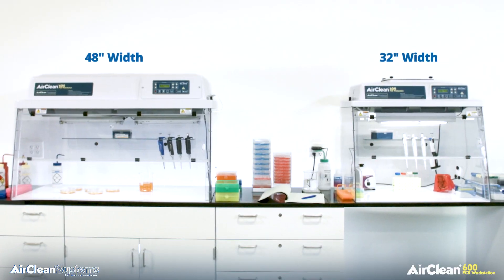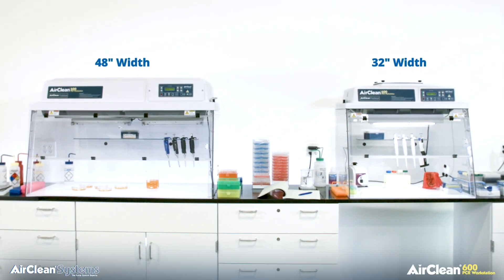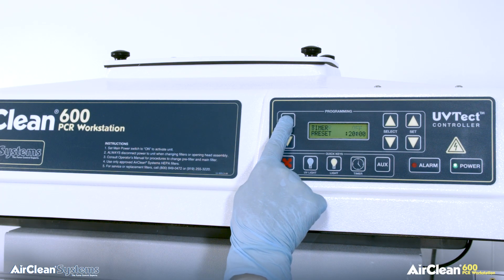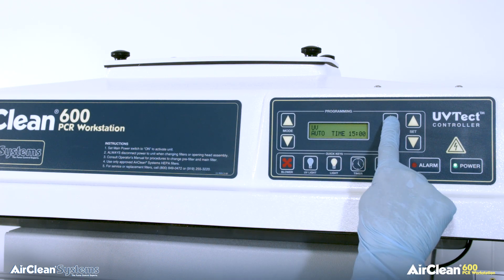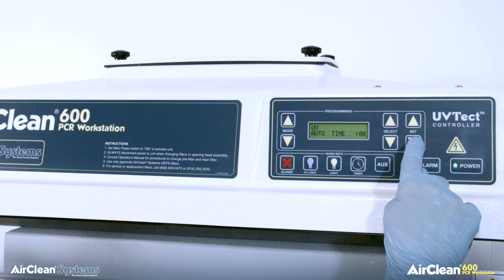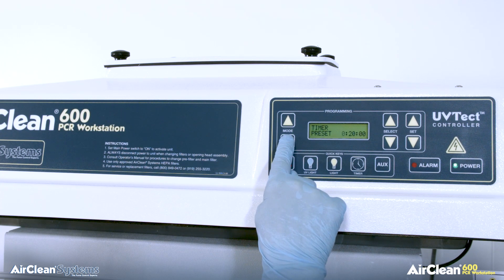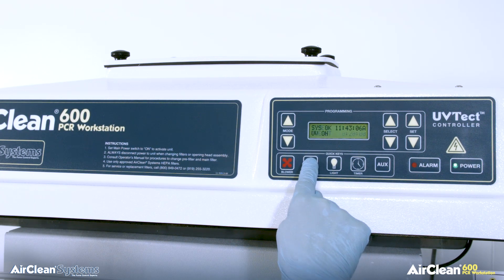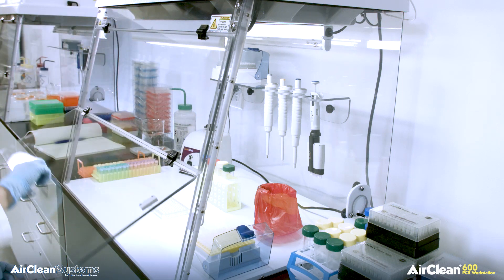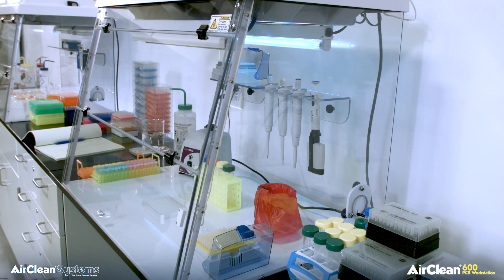The UV-TECT controller is standard on the 32 and 48 inch wide combination workstations. UV-TECT constantly monitors the effectiveness of the workstation, alerting the operator if the HEPA filter or UV bulb need replacement. UV-TECT automatically turns the blower on and off in relation to the position of the front sash. If the front sash is open, UV-TECT automatically turns the fluorescent light and blower on, providing an ISO 5 work environment. When the operator closes the front sash, UV-TECT automatically turns the blower and fluorescent light off and allows for the UV light to be activated.